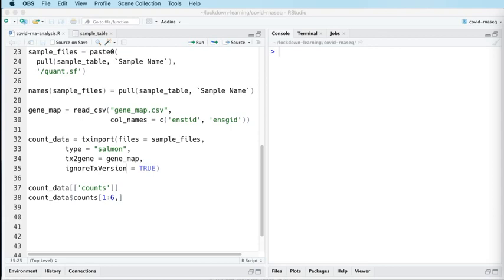So if you recall from when we've done this in the past, pretty much the first package that we installed was a package called BiocManager, and that's because that provides us with an easy way of installing packages, whether they're on CRAN or in Bioconductor. And that function is the install function of BiocManager. So that's what we're going to use to install DESeq2 here.